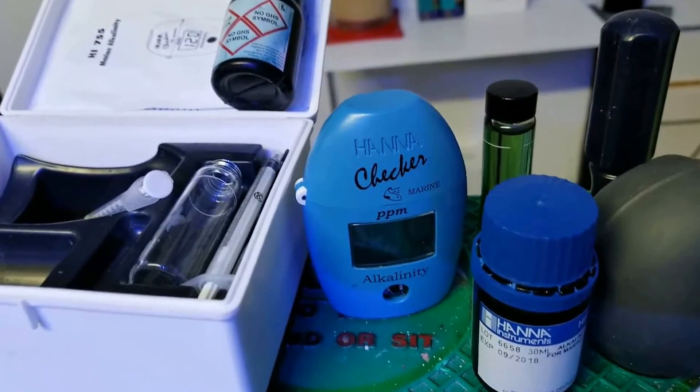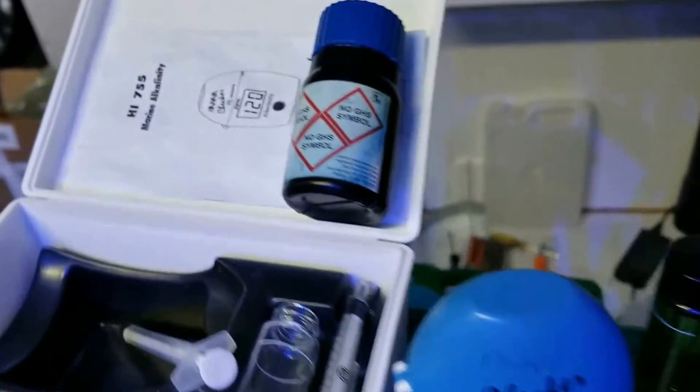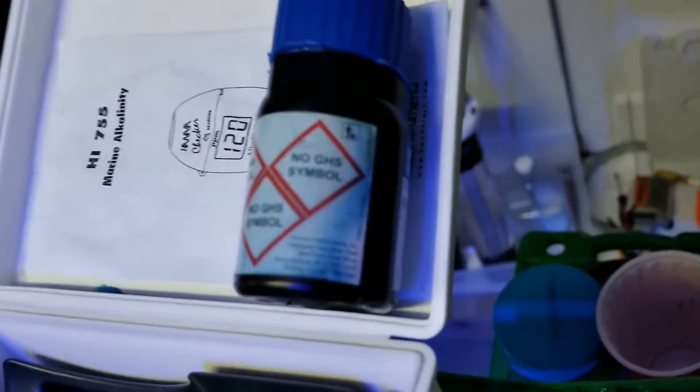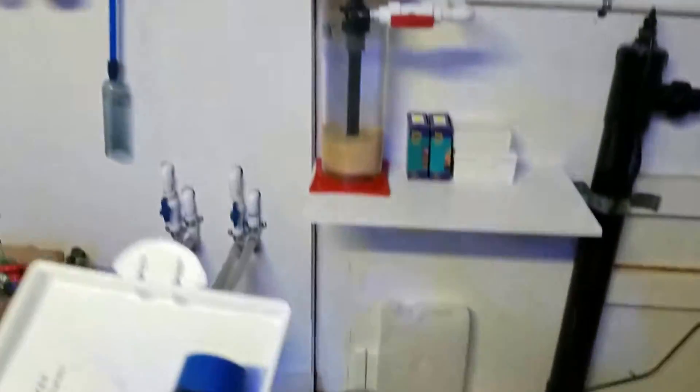Both reagents are from 2018, but I've had this one a while. When it came in with the case, it started leaking — as you can see the blue. When it was leaking, I figured it was okay.